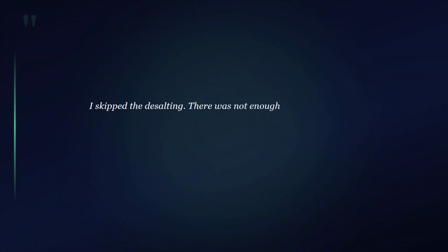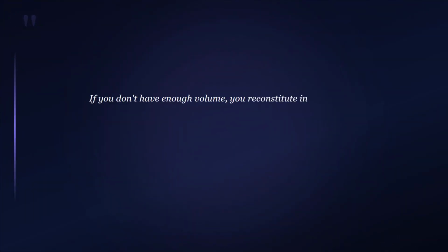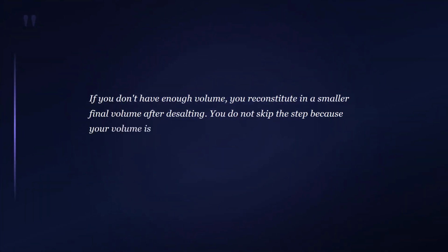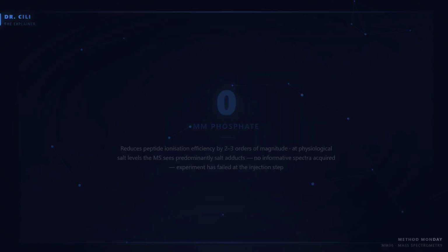I skipped the desalting. There was not enough volume after the digestion. If you don't have enough volume, you reconstitute in a smaller final volume after desalting. You do not skip the step because your volume is low. What you just injected onto a nano-LC system is a salt solution. Your back pressure will spike within 5 minutes. Your column is being contaminated. Your first injection is already ruined.